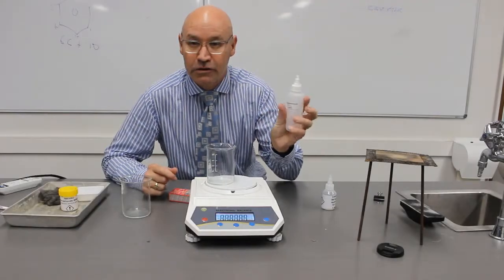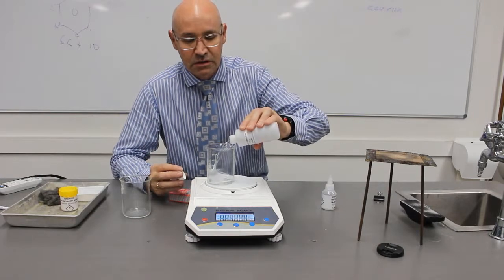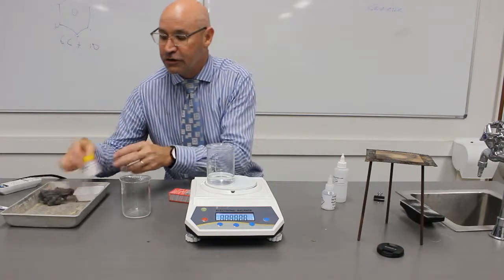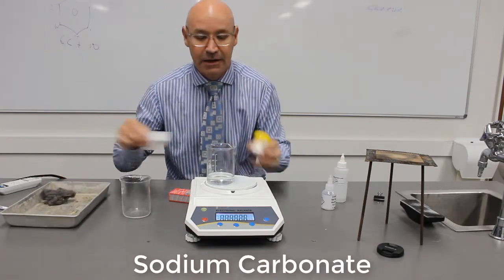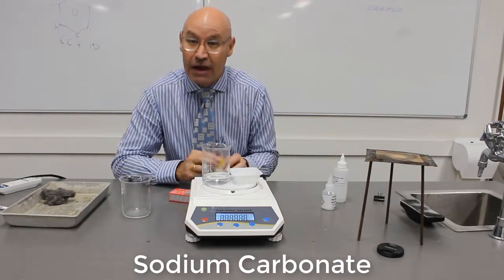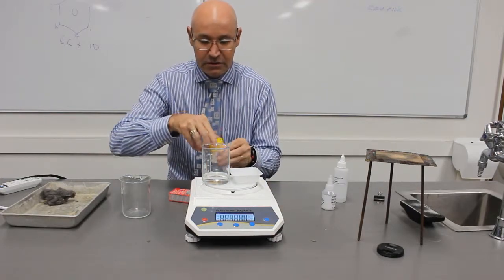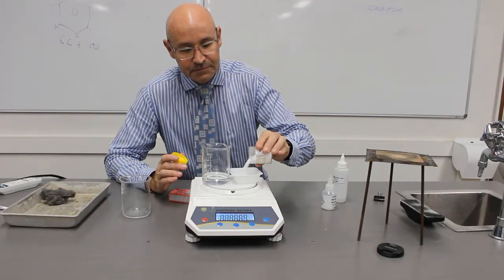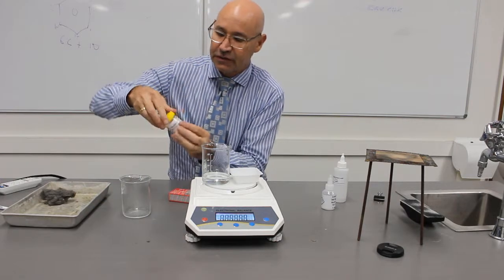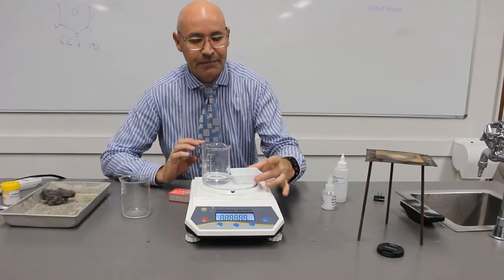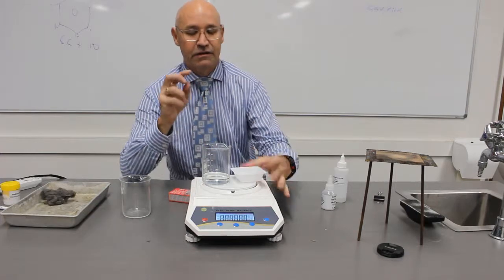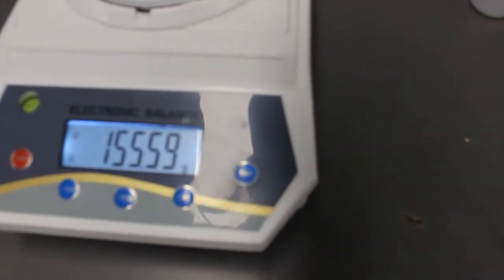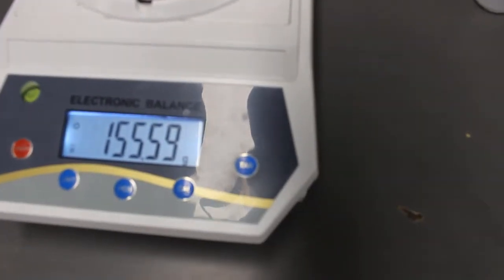In this next experiment, we're going to use hydrochloric acid again. And this time, instead of using a base, we're going to use a carbonate, sodium carbonate. Again, I don't need to be exact with the measurement because we're just measuring the difference in mass. So this is sodium carbonate and hydrochloric acid. Let's get our starting mass. As you can see, our starting mass is 155.59 grams.